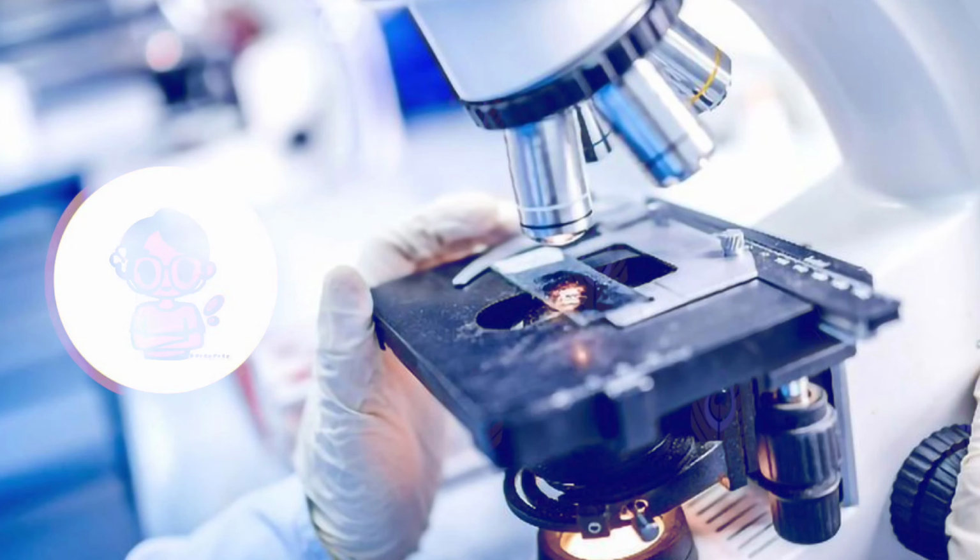Most microscopes use light and lenses, which are curved pieces of glass or plastic, to magnify objects. This means making them appear bigger than they actually are.